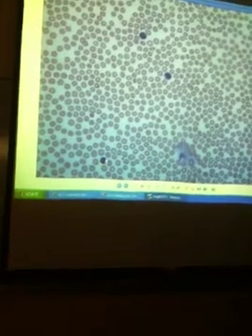Lymphocytes are more compact. If you look at it, you can see how this one looks kind of dotted in, like it has maybe granules inside. This is a granulocyte. This is an agranulocyte. It's solid, and then the background is clear. It looks more like a red blood cell. There's no granules inside. That leaves us with monocyte and lymphocyte. Lymphocytes are going to be almost entirely dark purple or blue like this, and then they'll have this little halo off to one side usually. So whenever it looks like a solid ball, that's a lymphocyte.